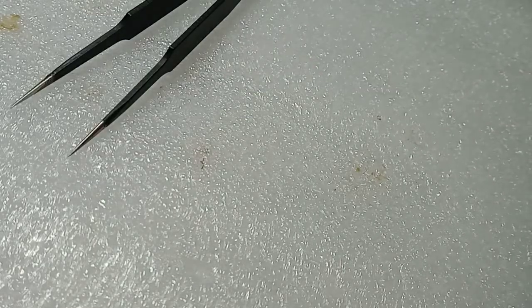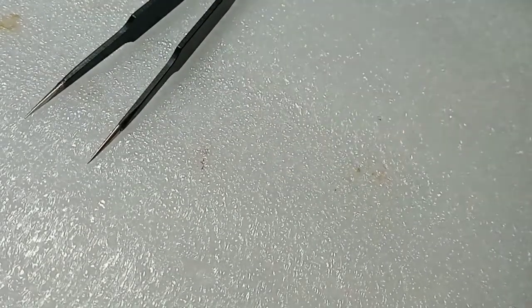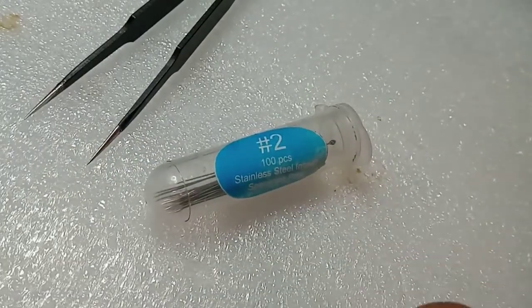What is up guys, and in today's video I'm going to be showing you how to pin a beetle. What you're going to need is entomology forceps, a beetle, and of course stainless steel insect pins.